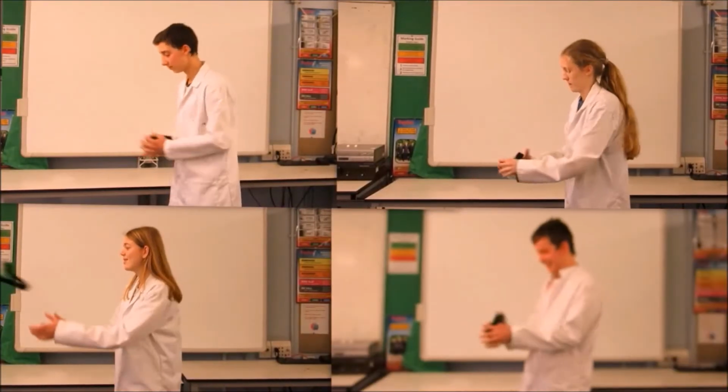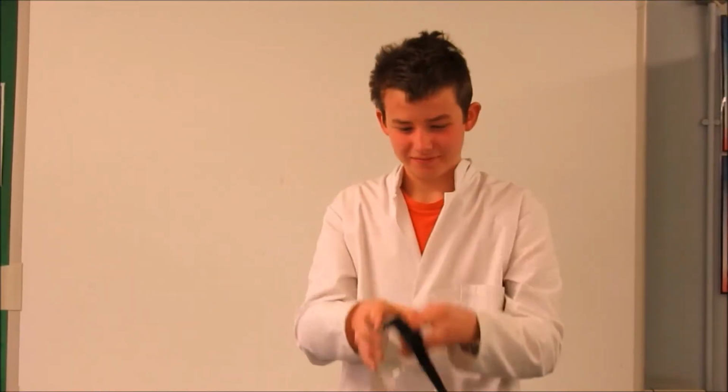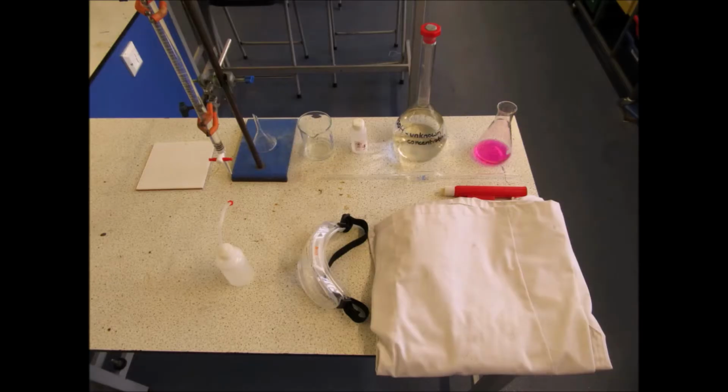Now put on your goggles. Preferably the right way up. Ensure safety precautions are in place, asking your teacher if you are unsure of proper safety practice.